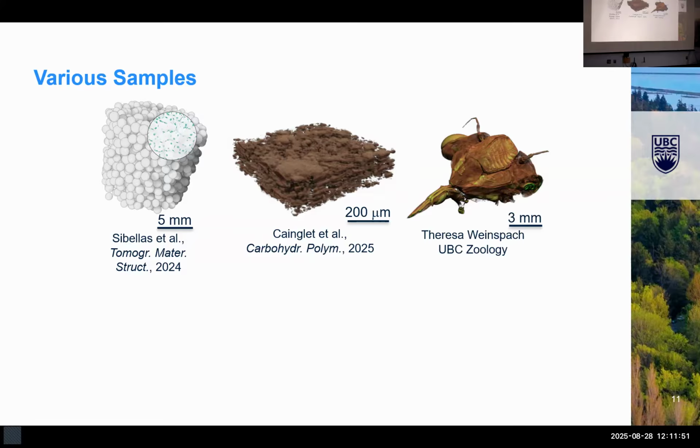Just in the past few months, we've had some people from zoology bringing us these cicada heads, and those turn out very nicely on the scans. Too nice, in fact, that I don't even really like looking at them too much.